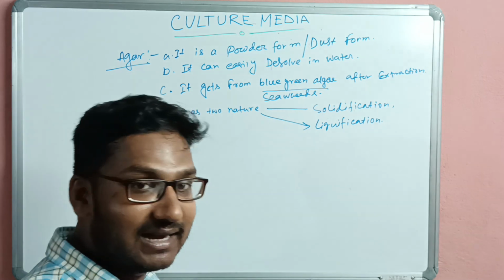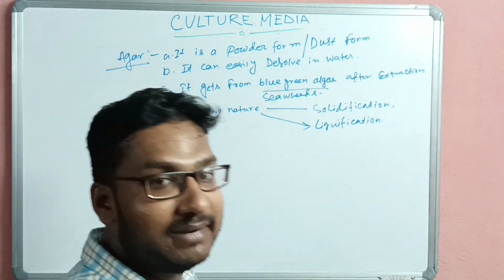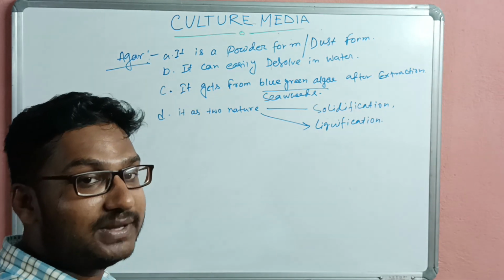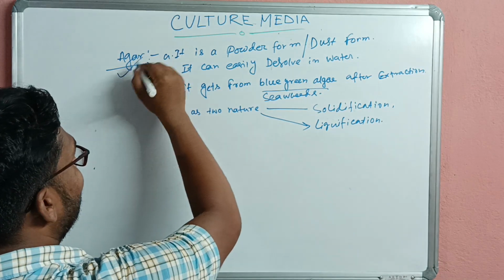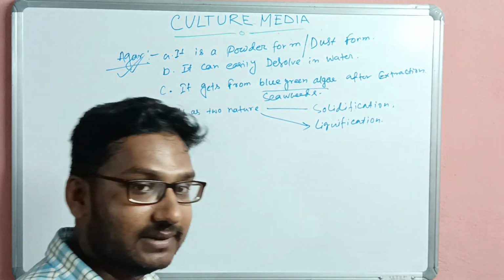And when it goes below 45 degrees centigrade, it will solidify. Because of these two natures, agar powder is generally used in culture media.